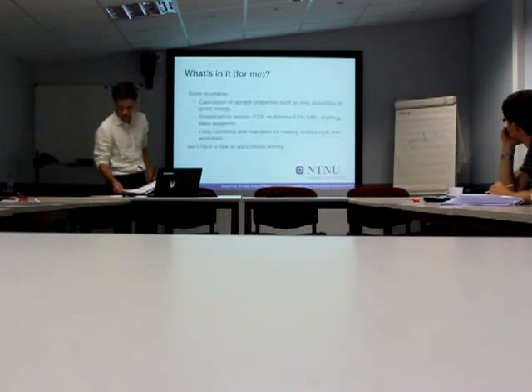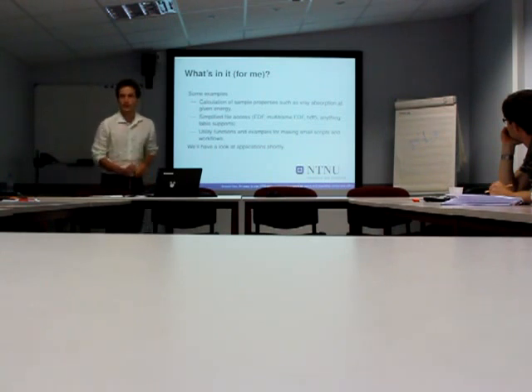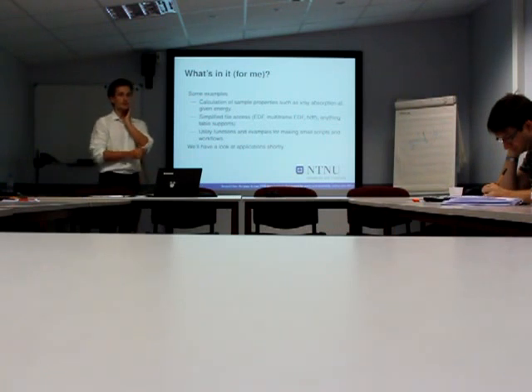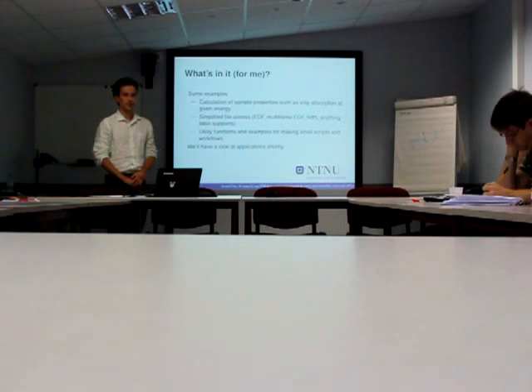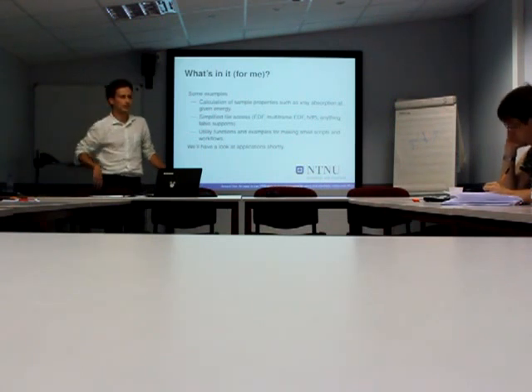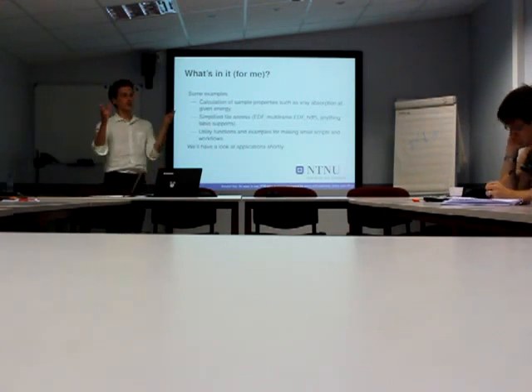Why would you want to use this thing? Well, so far it doesn't have too much. It has some old code that was rewritten from Vaio's MATLAB script for doing cross-section calculations, form factors, simulation examples, and so on. And I've done a lot of file input-output, reading and writing to HDF5 files, which is a hierarchy.